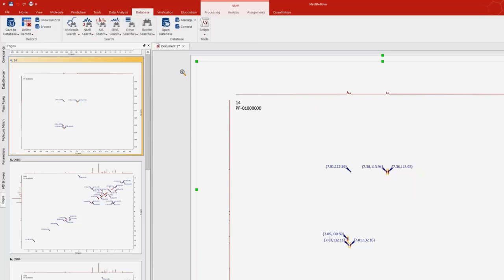I'm a little bit limited on time, so we're going to move a little further. If you go to other searches, you could do, for example, numeric searches or text searches, so show me anything that the chemist called Santi Dominguez has run, combined with a date and time search in the last 2 months. That will show you everything that I saved to the database in the last 2 months. And you also have this thing here called advanced search.